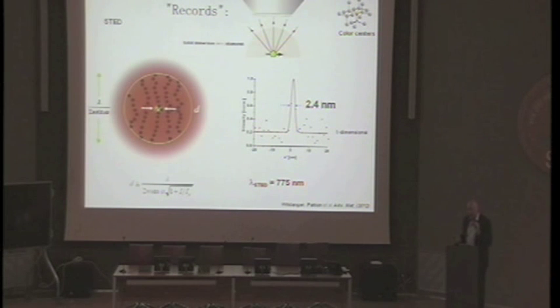The reason why I'm showing this is to show you it's a development that is going on, and the physics gives it, so to speak. If you sort out the molecular states, then we will get there. There is no doubt about it. So the resolution problem is not a conceptual problem in physics anymore. It has become, to some extent, a chemistry problem, a molecular state problem. And those who come up with the best molecules to get between two states, they will get the best images. There's no doubt.